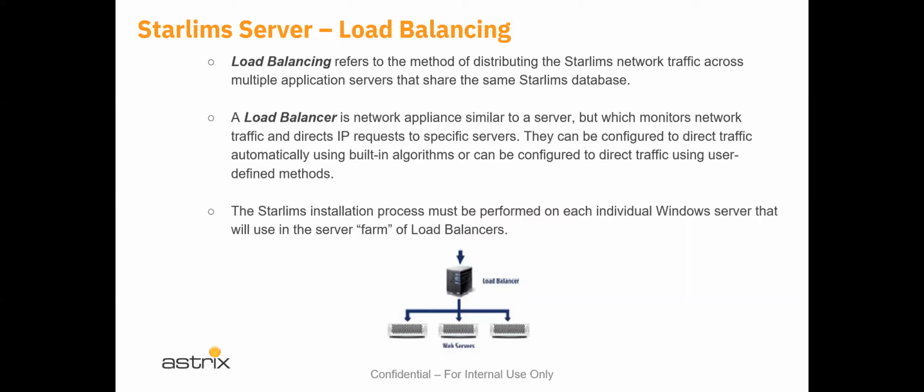Now, there are instances whereby, working closely with a system administrator, you can have one application server. This occurs mostly in virtual environments, where you've gone through the process of installing STARLIMS. Then they can take it and do image caching or image replication and create multiple servers from that one base installation. So you wouldn't necessarily have to go through the same installation process on every one of the servers. However, the configuration using the MMC STARLIMS configuration tool has to be performed separately on each machine.